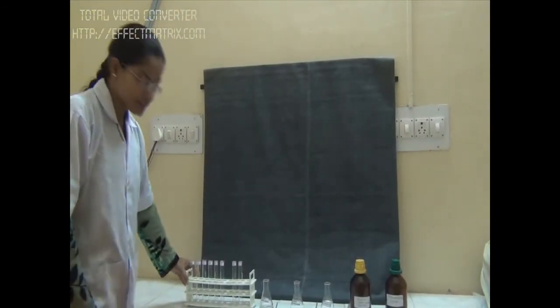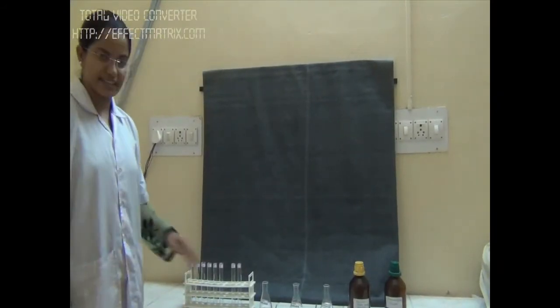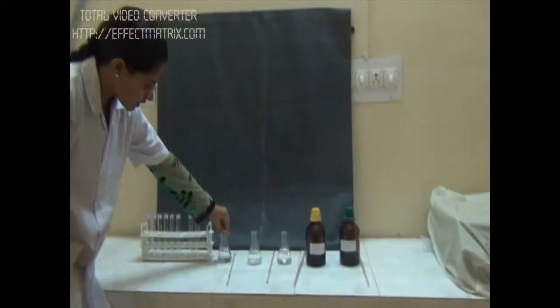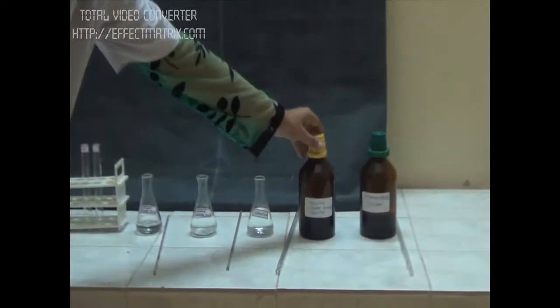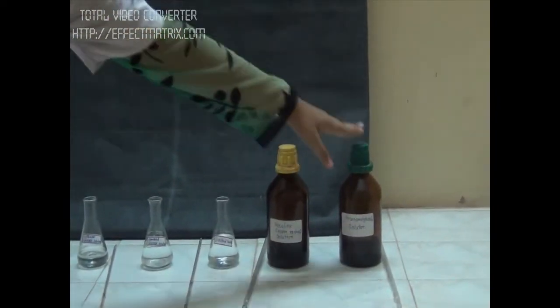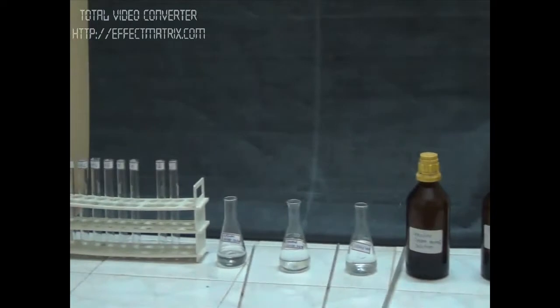So today we are going to estimate the amount of reducing sugar by Nelson's Somogyi method. We are having our unknown glucose solution, standard glucose solution, distilled water, alkaline copper tartrate solution, and arsenomolybdate solution. These are our reagents.